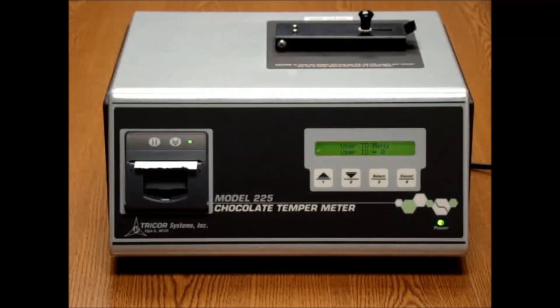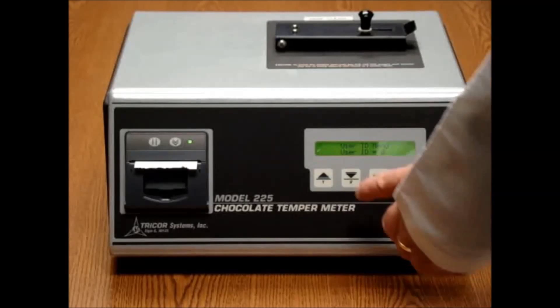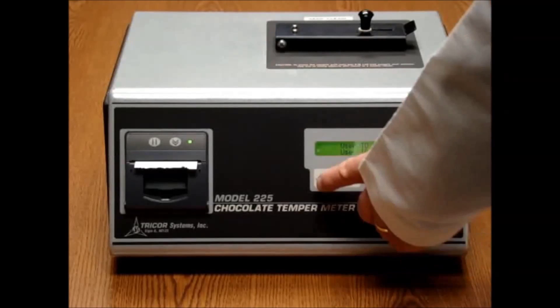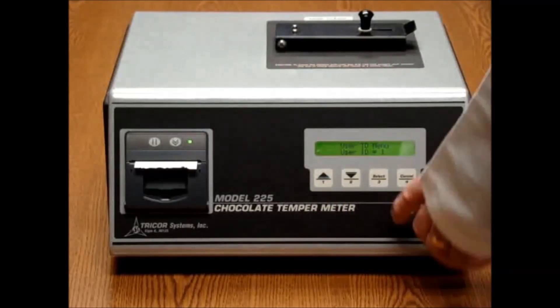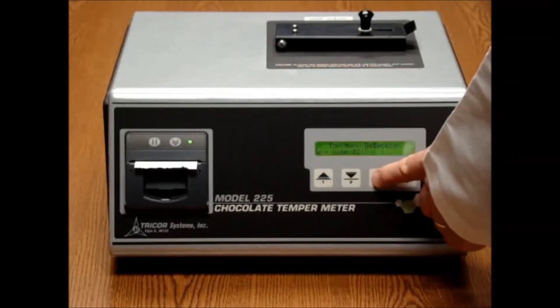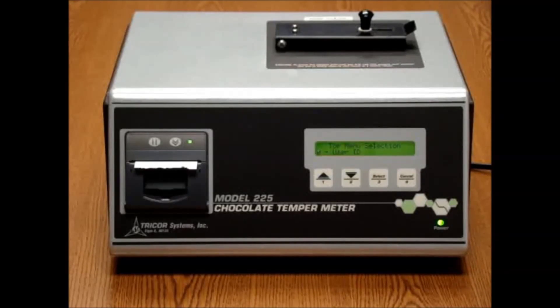The user ID on the Model 225 allows you to choose between 1 and 199 as the user ID. For the purpose of demonstration, we will use 1. Once you click select, that user ID is now entered.